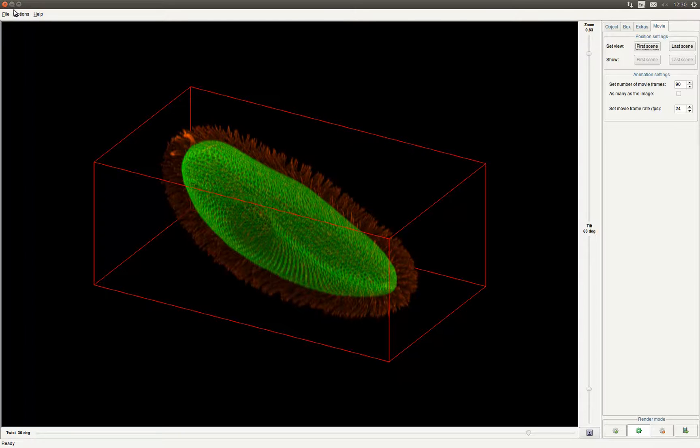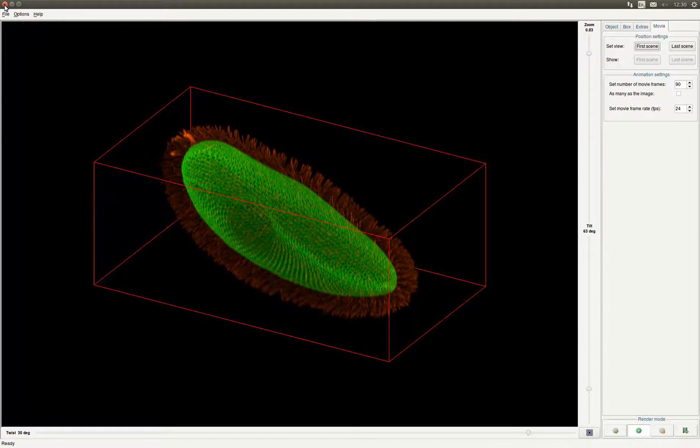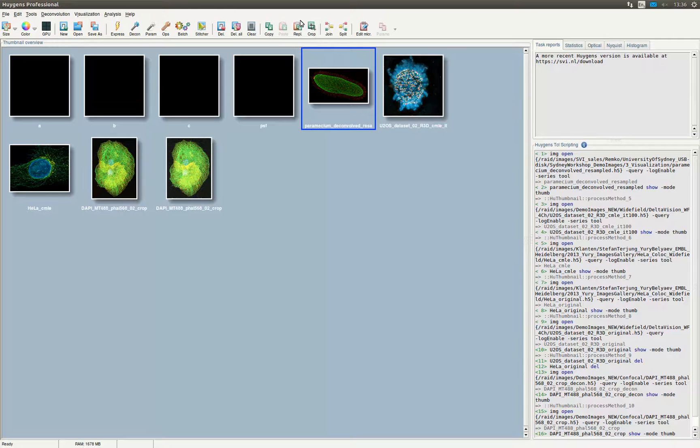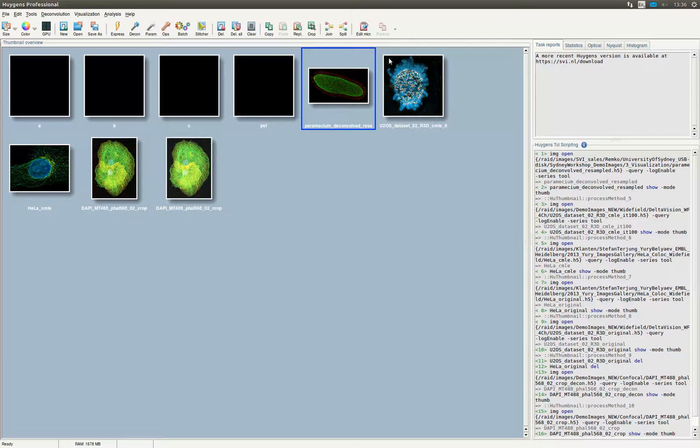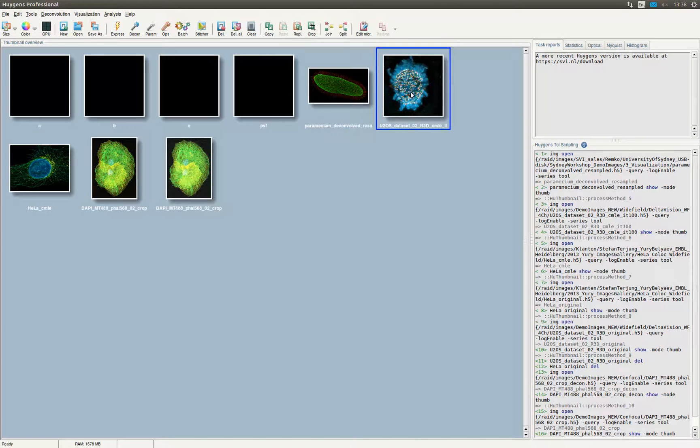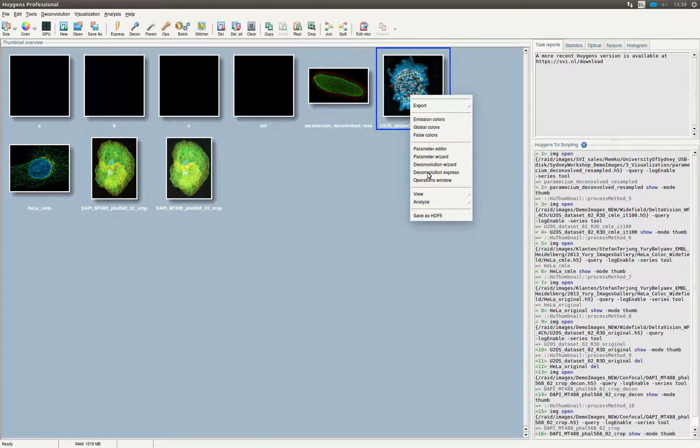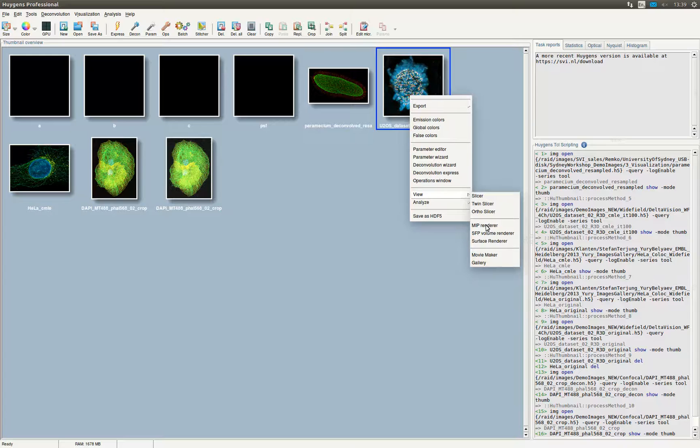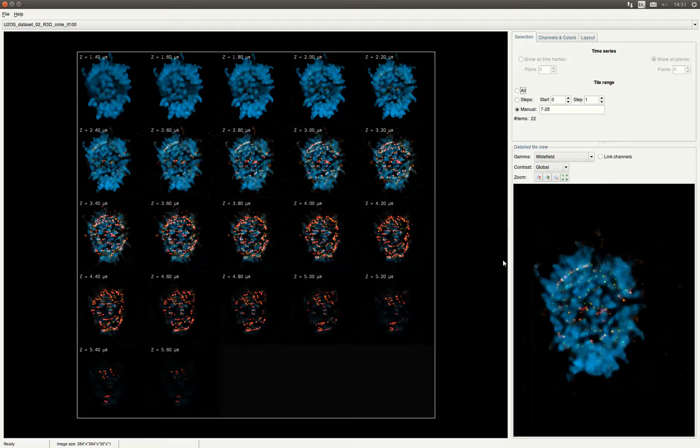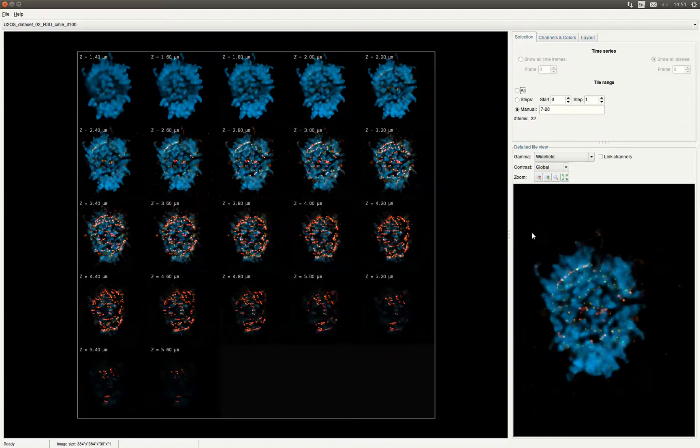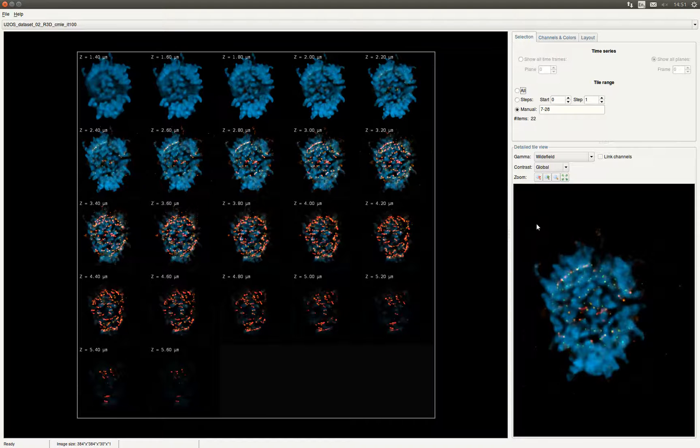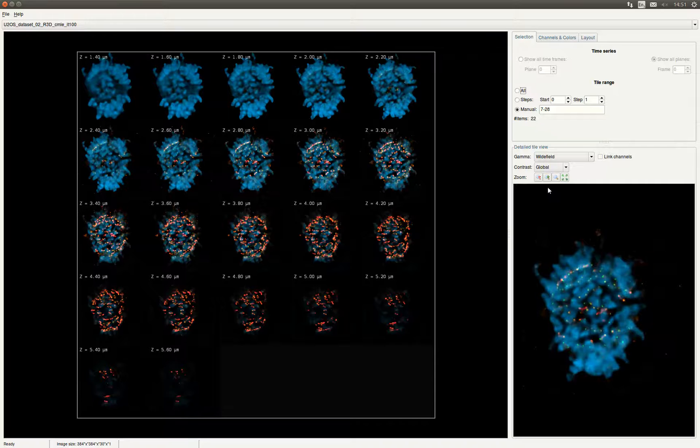We close the MIP renderer and go to the last free visualization tool. Back in the main window of Huygens we select the last image and right-click this image. Go to view and click gallery to open the gallery tool. The gallery tool gives you a quick overview of your image. Instead of slicing through your image using a slider, the gallery tool displays the individual slices of your Z stack or time series next to each other.